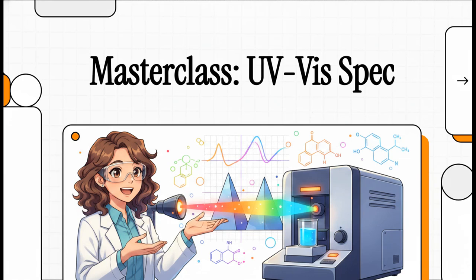Hey everyone, and welcome to a brand new explainer. Today, we're stepping virtually into Dr. Kem's laboratory for an absolute masterclass on what has to be one of the most heavily relied upon analytical tools in all of modern science, the UV-Visible Spectrophotometer.